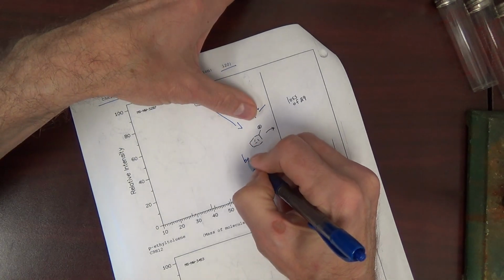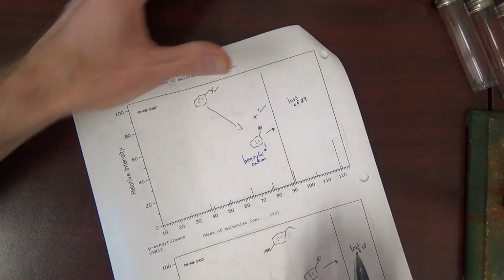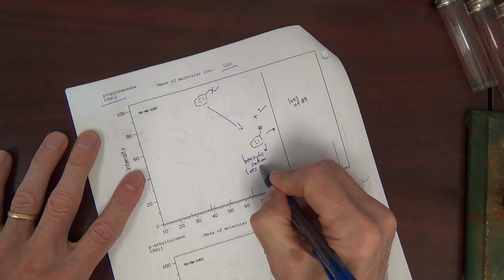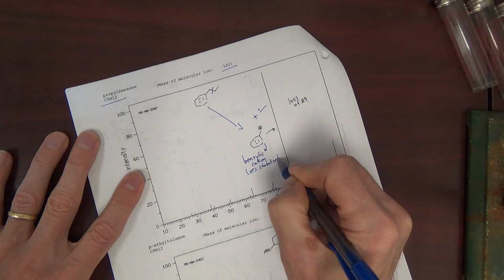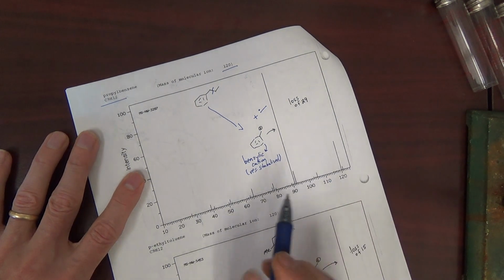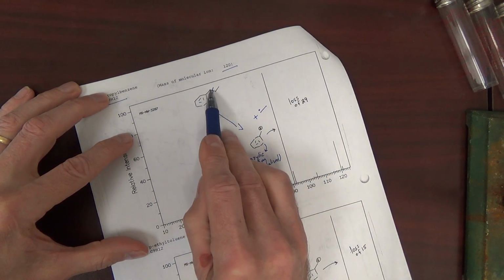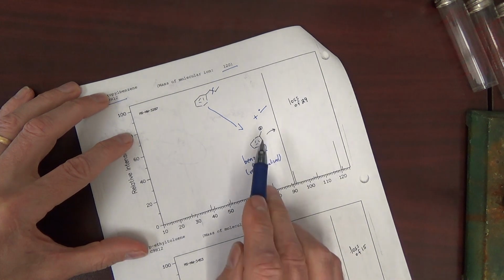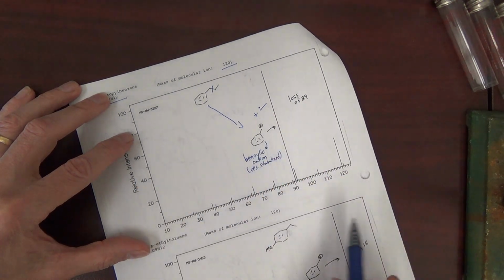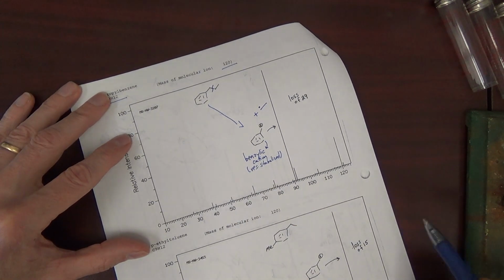And this cation is a benzylic cation. We saw benzylic cations in class. Okay, resonance stabilized. Look back at your benzylic cation with your resonance structures of this in class. This can be called alpha cleavage if you consider the benzene ring sort of the business end that's going to be helping you here. We cleave between the first and the second carbon. Benzylic cations are commonly seen in mass spec, where we form cations. But we form good cations when possible, and the benzylic cation is a very good cation.